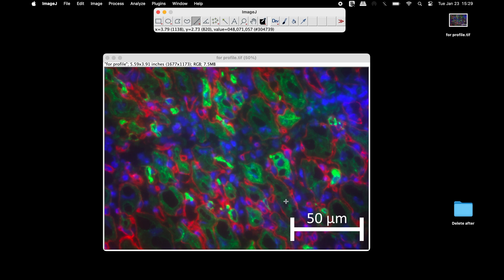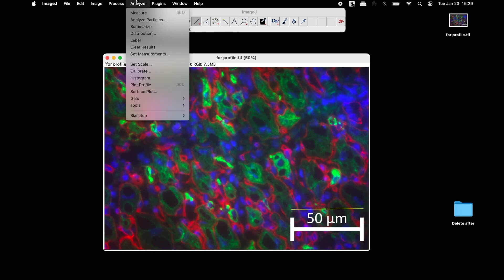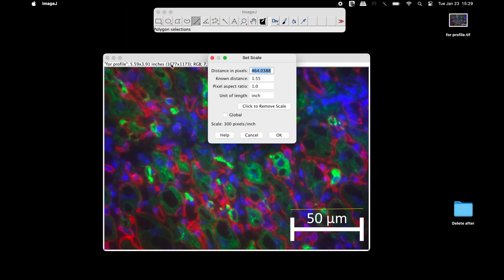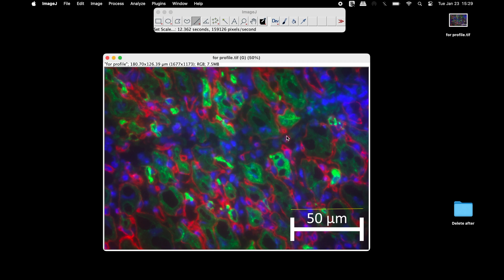If you have a scale bar in the image, set the scale accordingly. Draw a straight line parallel to the existing scale and input the known parameters. Check the option global to analyze multiple images using the same scaling, and then click OK.